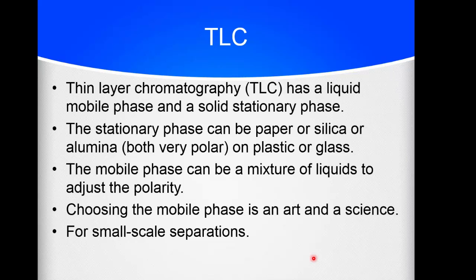The mobile phase can be a single component liquid or multiple components making a mixture of liquids. And you're choosing your mobile phase to hopefully get perfectly good separation between your components. And therefore, it's both a little bit of art and a little bit of science. Tailoring your mixture to get good separation of your components can be a real challenge. We give you the mobile phase already mixed for you, so you don't have to worry about that art and science and just see how well you can separate your components of an ink pen.